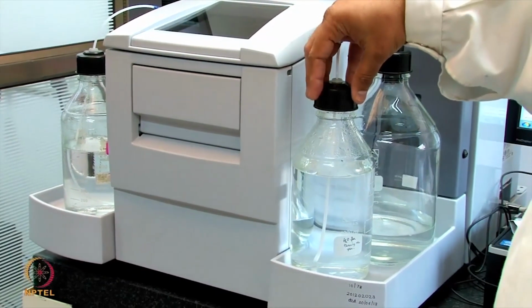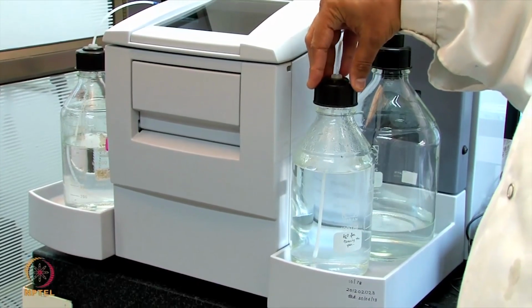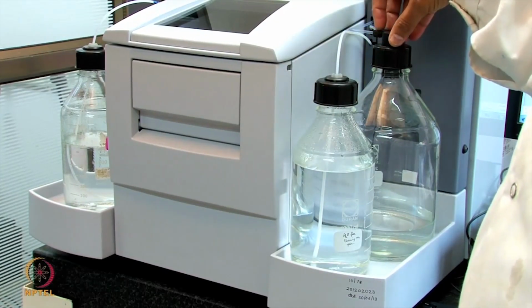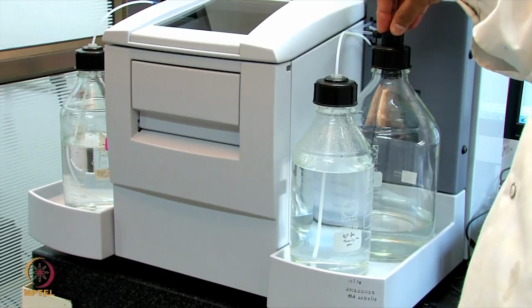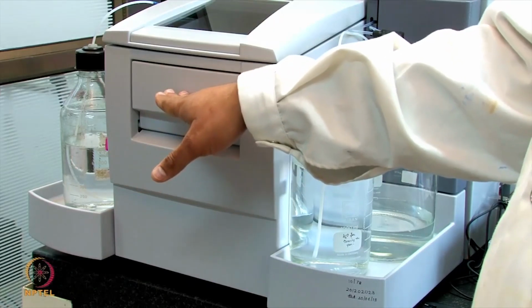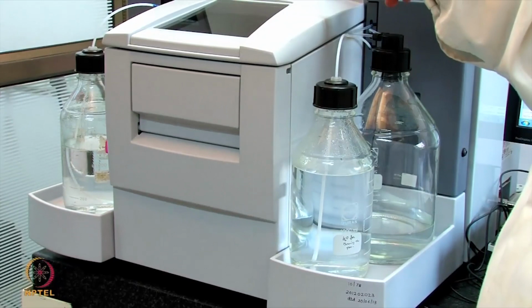Coming here, we have a water reservoir. The water reservoir is useful for cleaning needles and syringe, and we have a waste reservoir here, and this waste reservoir collects all the waste. The samples are actually sent in this compartment. Chip is docked at this compartment.